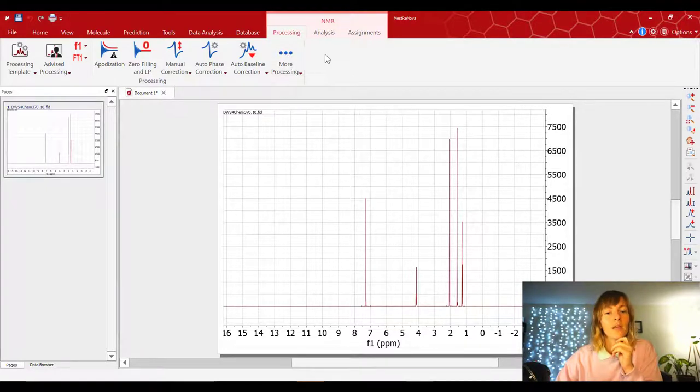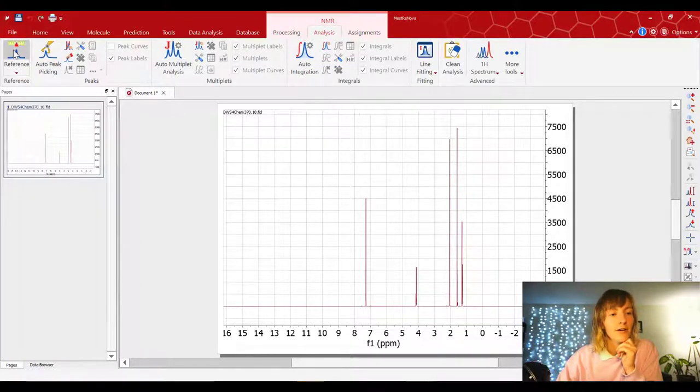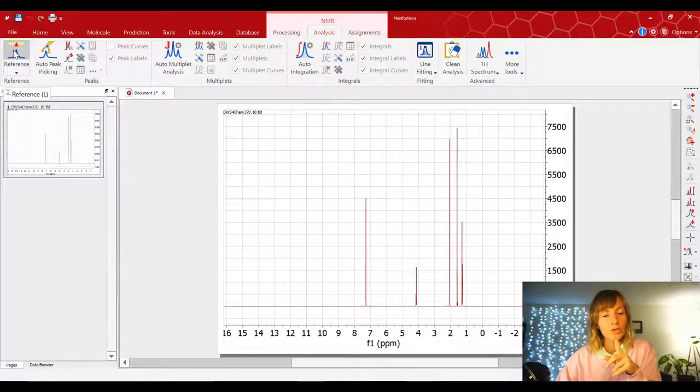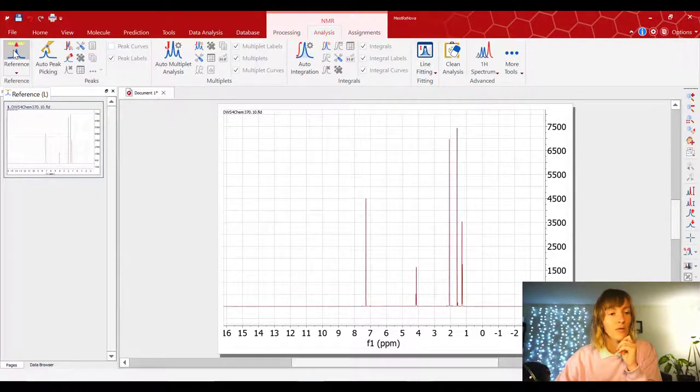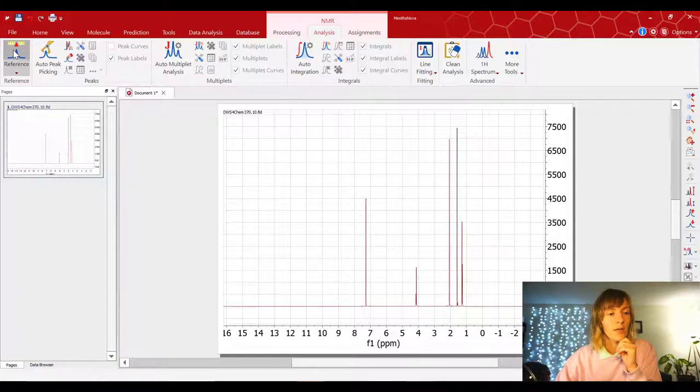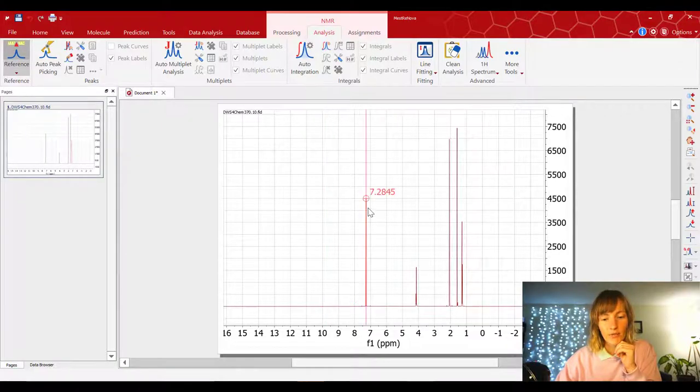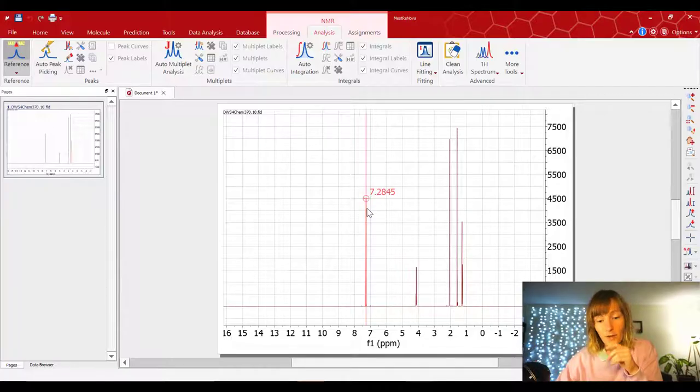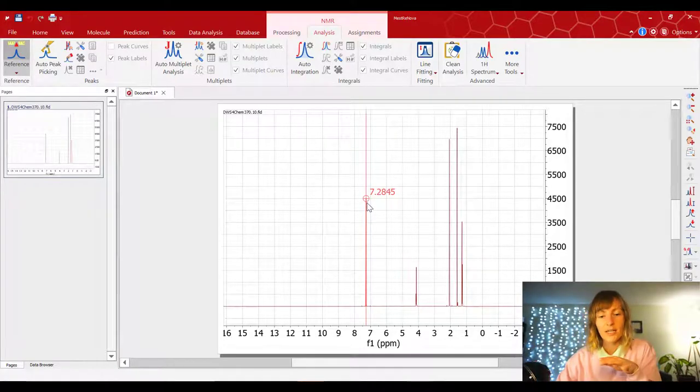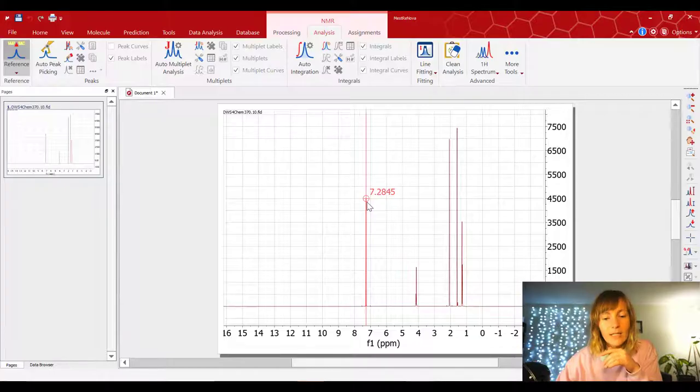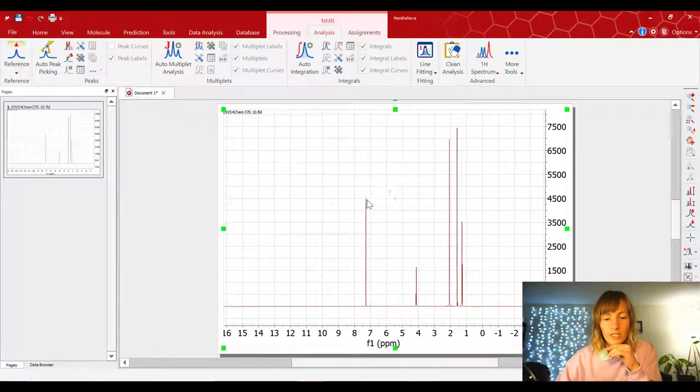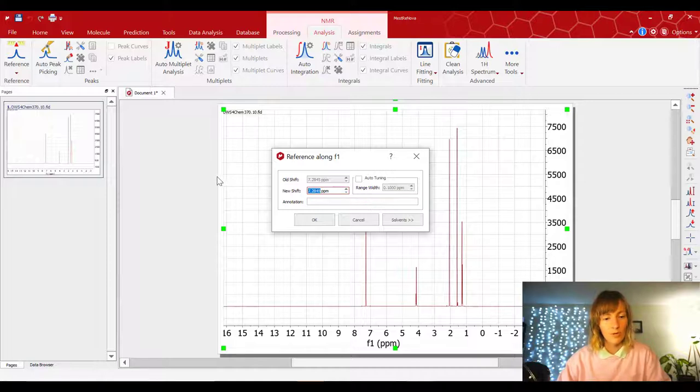And to do that, we're gonna come over here to Analysis under the NMR tab. And we're gonna select the Reference button. Another way to do this is to press the L key on your keyboard, and that will also bring you to the same function. So press on the reference, then come over here, and you'll see that the software finds the peak, and it says that it's at 7.28, and that's the peak that we're looking for. So go ahead and just click on that, just a normal left click.